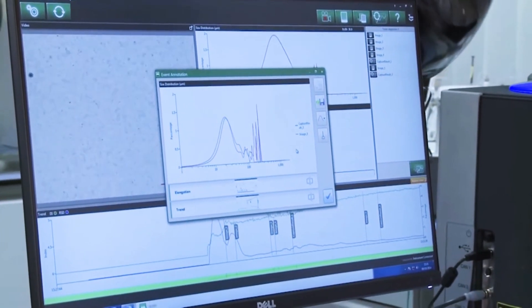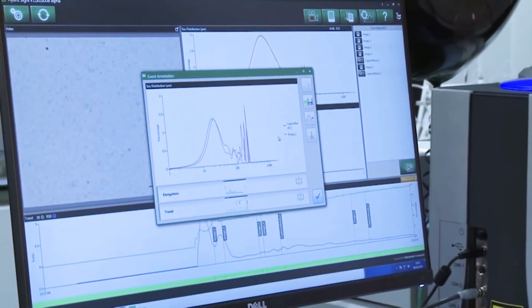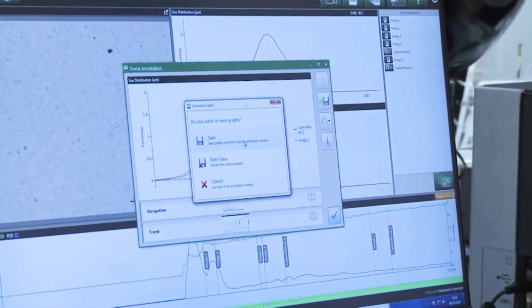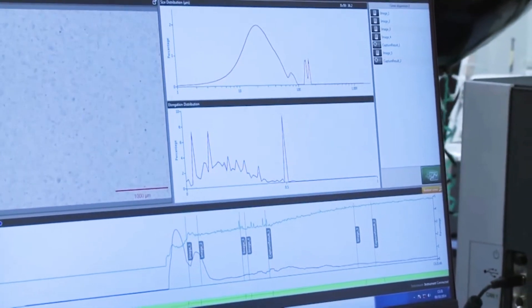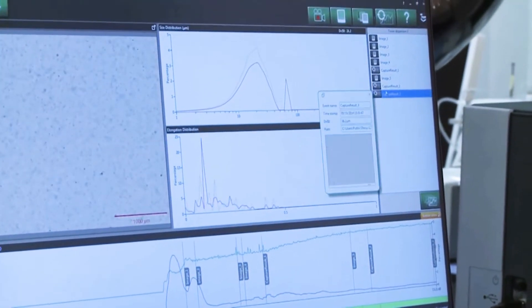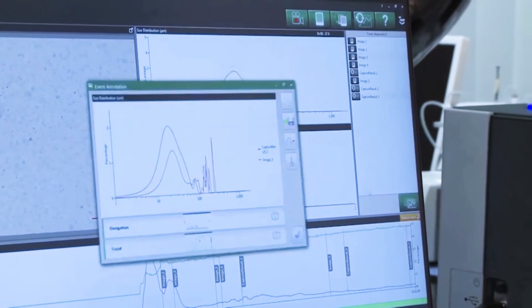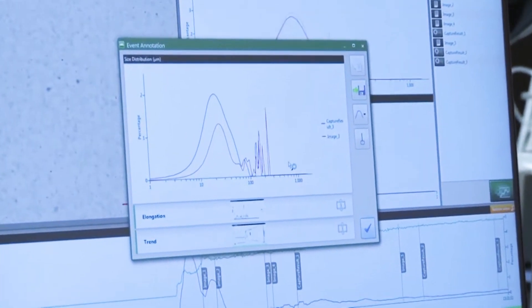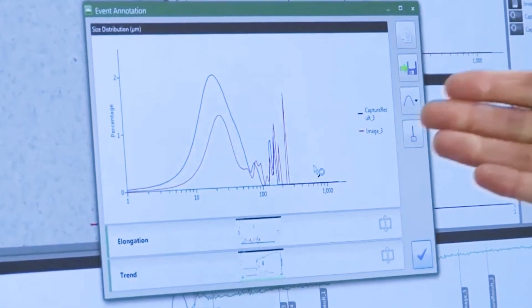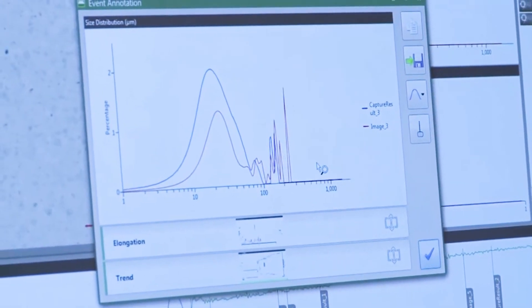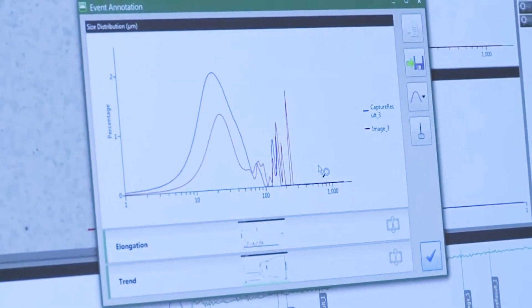I'm just going to take those two images and compare the results. So overlaying the size chart, we can see there is indeed a shift towards smaller particles. I'm going to take one more and compare that as well. And now we've been having the ultrasound going for much longer—the red at the start and the blue at the end—we can see that the particle size has definitely shifted.